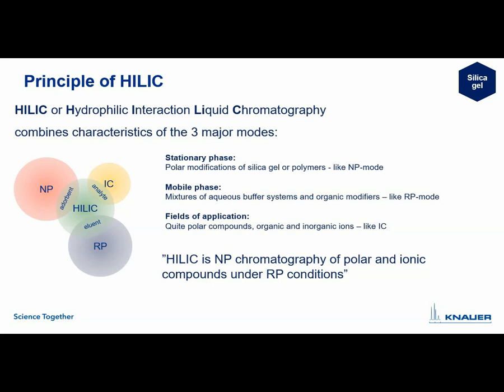I already told you, HILIC means hydrophilic interaction liquid chromatography, and it combines some characteristics of the three major modes that we know from chromatography. So you know normal phase and reversed phase, and there is also ion chromatography, which is a really well-known mechanism for HPLC. And HILIC combines something from every world. So the stationary phase, as we saw, is the same as in the normal phase mode. You can really use the same column that is offered for normal phase for your HILIC application.